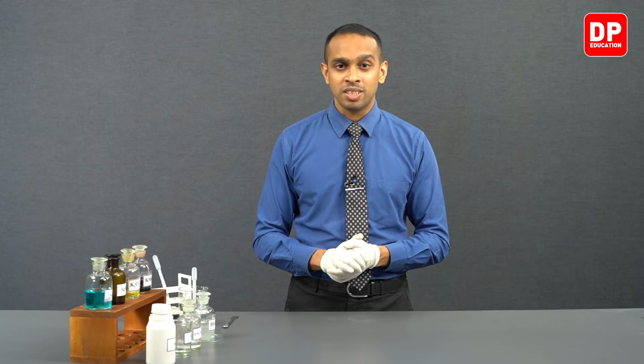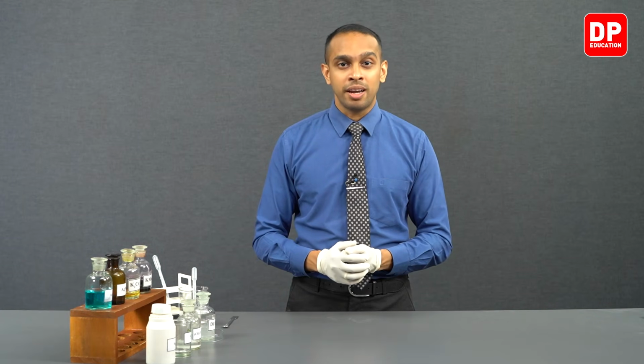So students, these are the identification tests that we used to identify the presence of sulfide ions along with their observations. Now let's move on to thiosulfate ion.